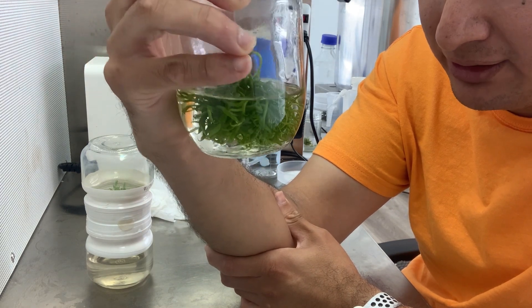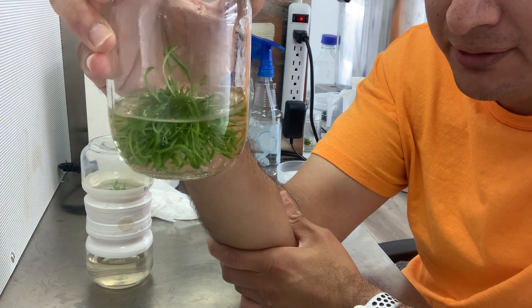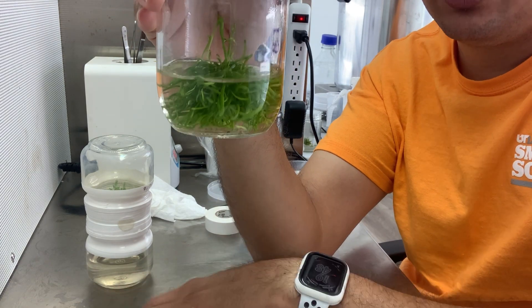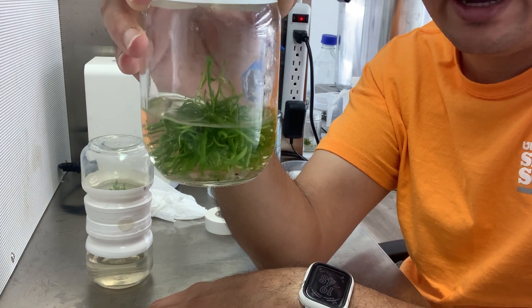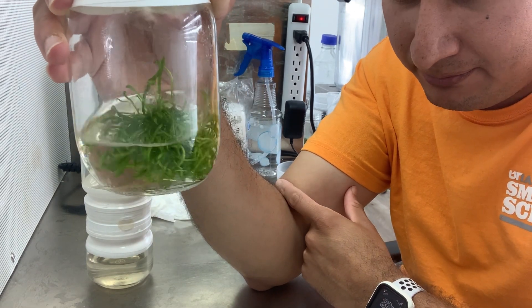The plants look very healthy. They look a little bit etiolated — that was because I left them here in the hood where they didn't receive a lot of light. I need to put those under the light so they grow better.